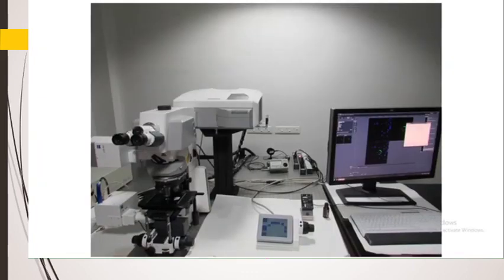This is a Zeiss confocal microscope. Here you can see the main confocality lies in this scan head. The scan head holds a pinhole and the detector. So this is the important part. If you get rid of that, the rest of the microscope is nothing, just like an epifluorescent microscope.